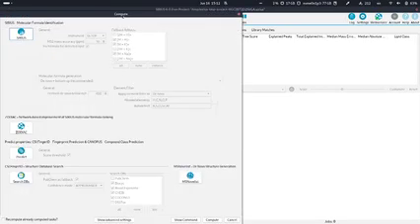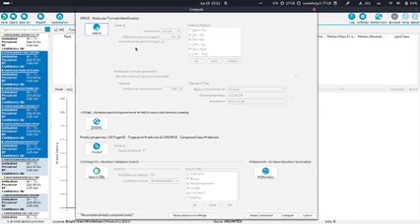Okay, just to walk you through a little bit of the computation dialogues. So this will be something you will probably look at quite often if you use SIRIUS. So it's important to know at least in general what you can enable here and how you can change the settings here. As I said, this is now the normal mode without the advanced settings. I will show you later what is added when we enable this advanced mode.